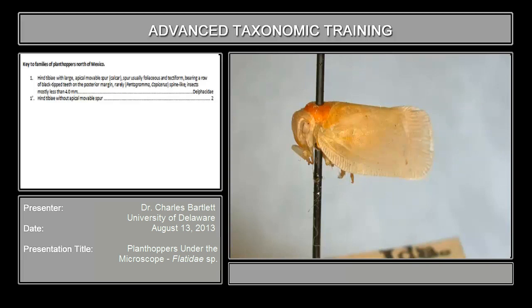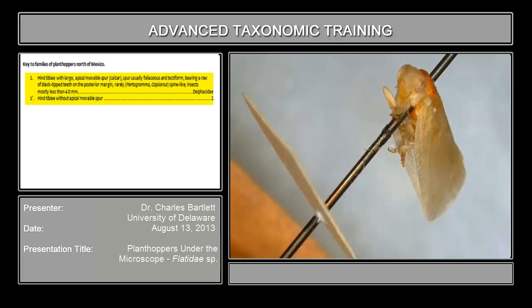Beginning on the key to families, the first couplet reads: the hind tibiae with a large apical movable spur, as opposed to that spur being absent. Let's take a look at the hind leg. Right there is the hind tibiae, and we have the first, second, and third tarsomeres. If the spur was there it would be right there — and it is not there. You can read the rest of the couplet describing the calcar, but the calcar is absent.